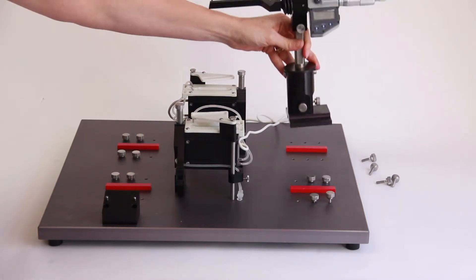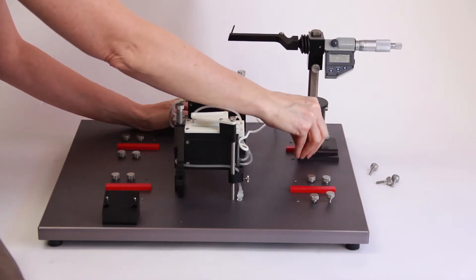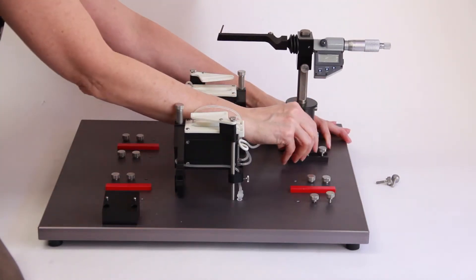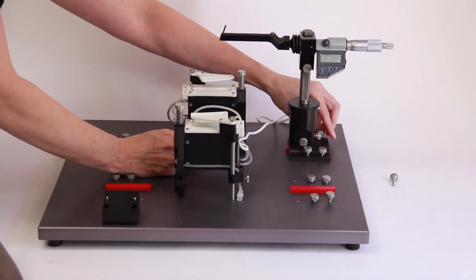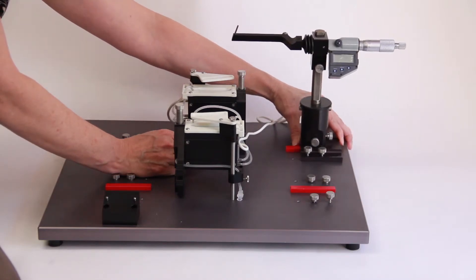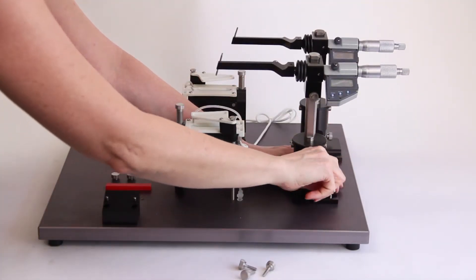Position the micrometer assemblies, or motor assemblies, on the right side of the base plate so that the mounting slots on the micrometer align with the holes in the base plate. Make sure that the digital displays of the micrometers face the front of the base plate. Use four holes and insert four thumb screws through the slots on the base of the micrometer assembly and into the screw holes. The position of the micrometer is flexible depending on the screw holes you choose and how you position the micrometer assembly. When the micrometer is in position, tighten the thumb screws. In a similar way, mount the second micrometer or motor assembly next to the first.